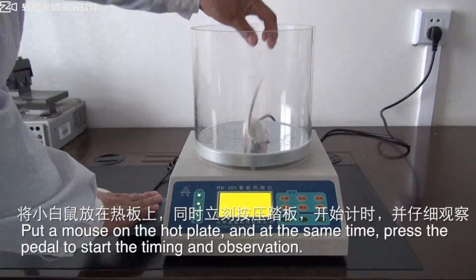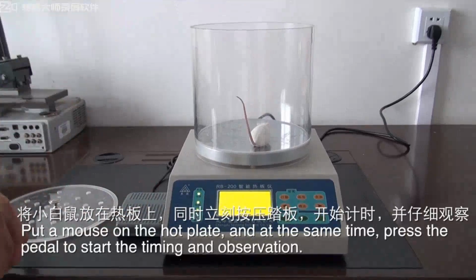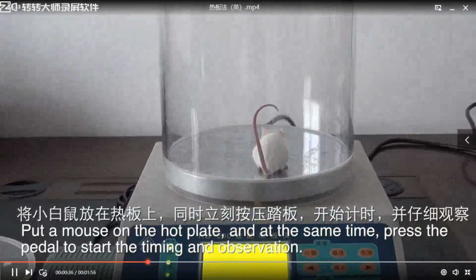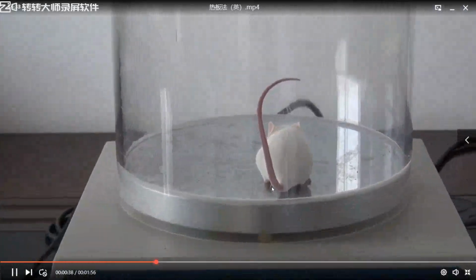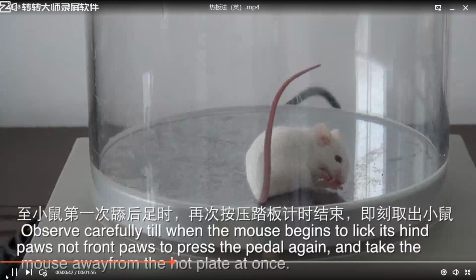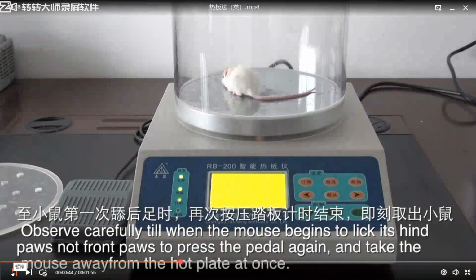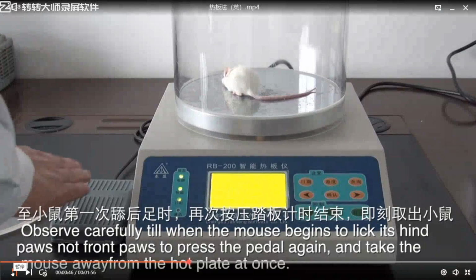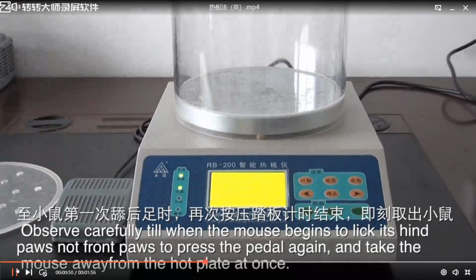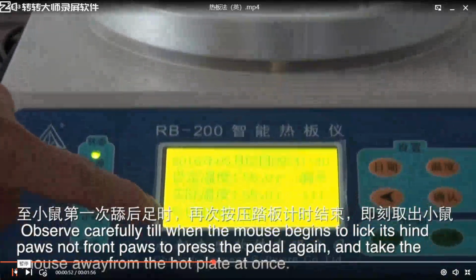Put a mouse on the hot plate, and at the same time press the pedal to start the timing and observation. Observe carefully until the mouse begins to lick its hind paws, not front paws, then press the pedal again and take the mouse away from the hot plate at once.